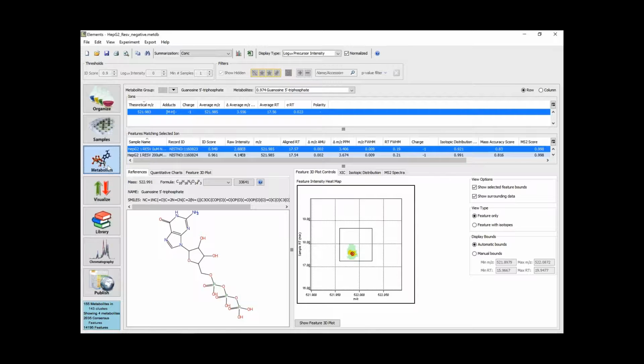And it provides you a lot of detailed information about the identified metabolites. There's the metabolite listing tables up on top, and the bottom part is 2 separate panes. Now, the top part is separated by 2 other views, and that'd be the metabolite list tab and the ion pane.